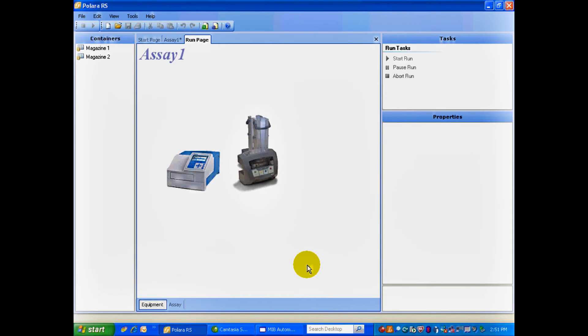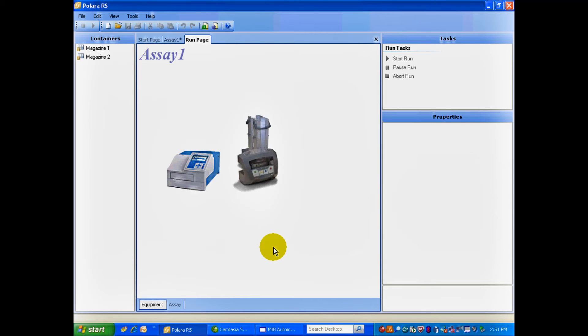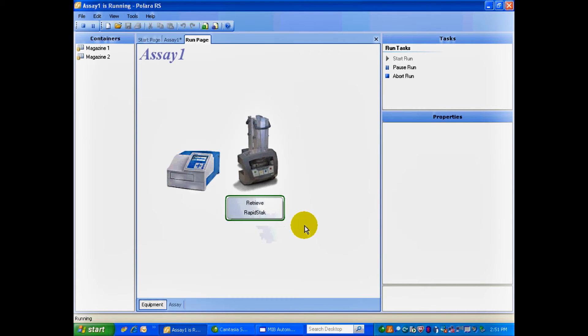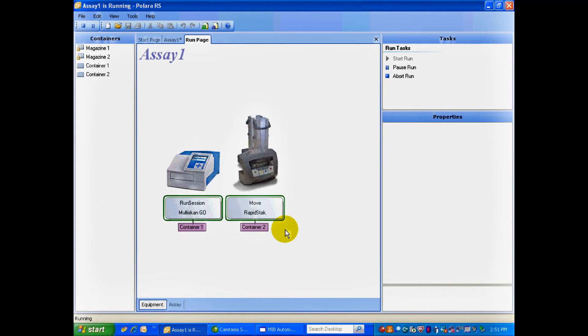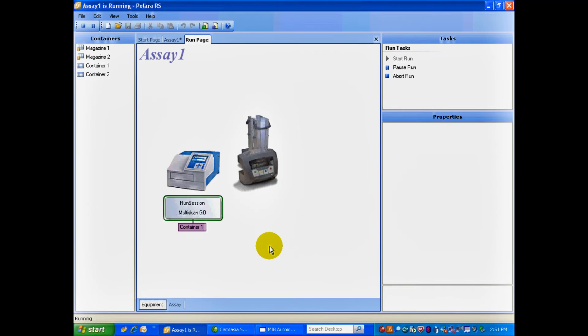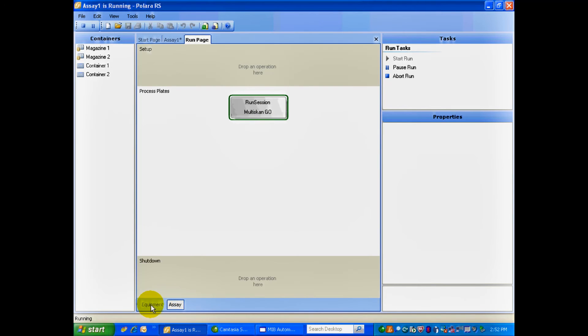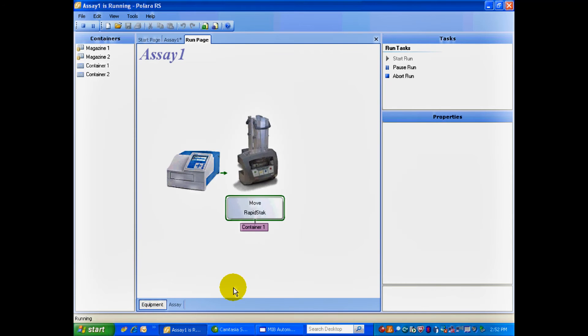What you're hearing in the background, is the Rapid Stack homing and configuring, as well as communicating with ScanIt. What you'll see here in a minute on this Assay Run page, is the entire process laid out in front of you, plate by plate, as it describes what it's doing. As you can see now, the Rapid Stack is retrieving Container 1, and it's going to move it to the Multi-Scan Go. The Reader is performing its run, as the Rapid Stack preps Container 2. This will continue on for as many plates as are in the run. We can also toggle back and forth to the Assay page and the Equipment tab. Now let's see what this looks like on the actual instrument.